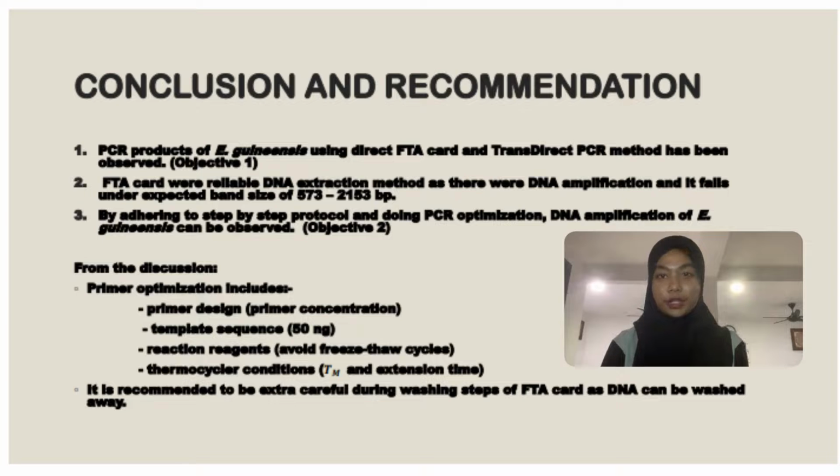To conclude this project, PCR products of Elaeis guineensis using direct FTA card and transdirect PCR method have successfully been observed. From findings from this experiment, FTA card was reliable as it produced enough DNA concentration needed for PCR analysis. And it is important to follow step-by-step protocol and do PCR optimization to ensure the success.